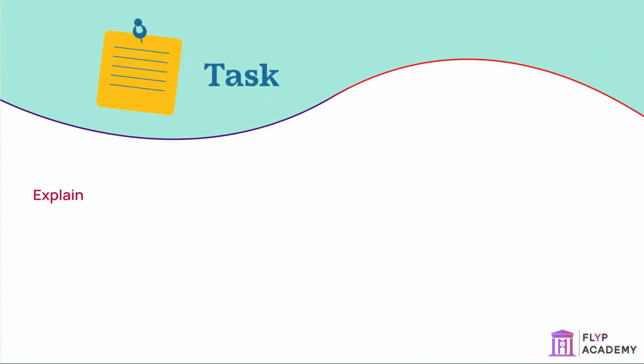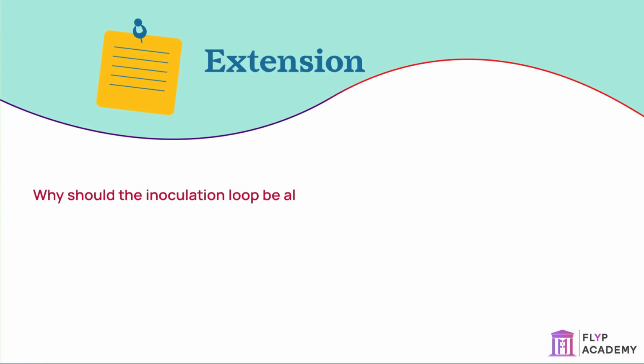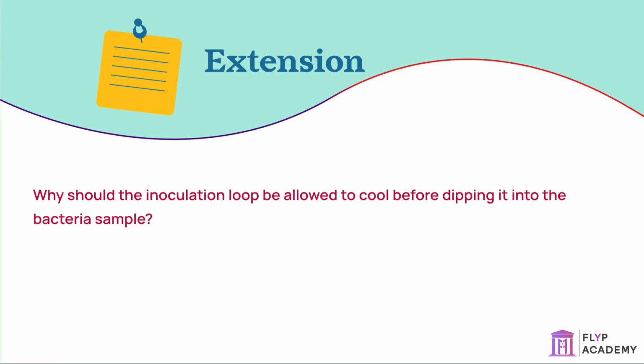Task: explain why the inoculation loop is heated in a flame. Extension: why should the inoculation loop be allowed to cool before dipping it into the bacteria sample?